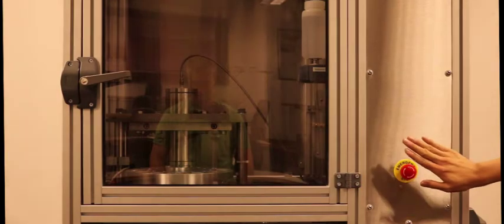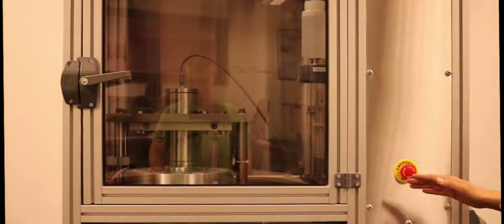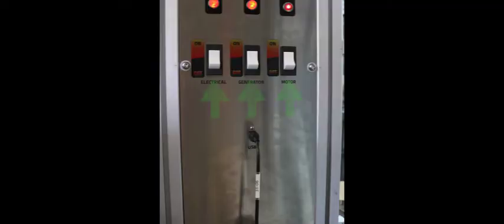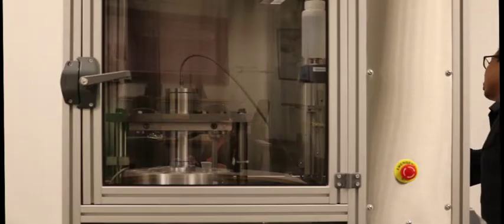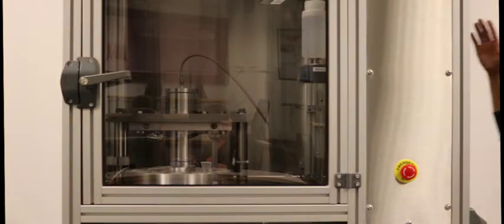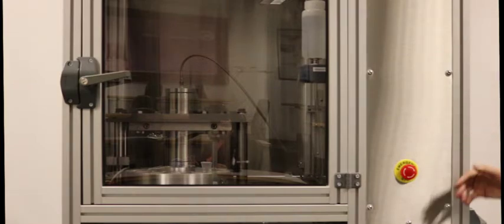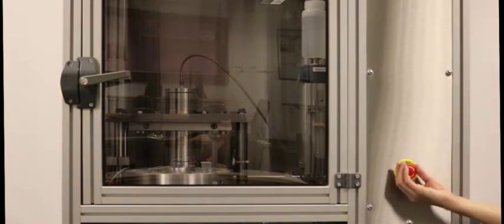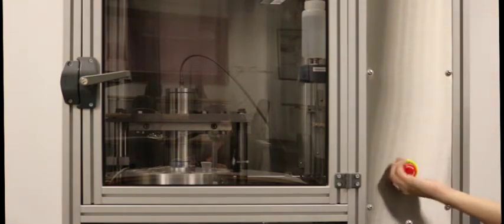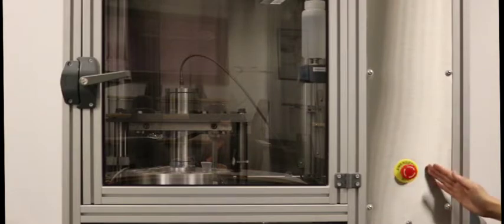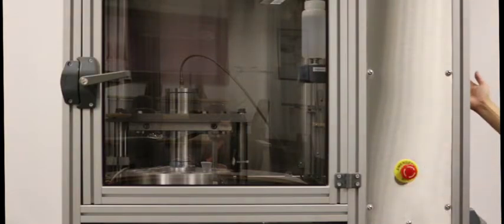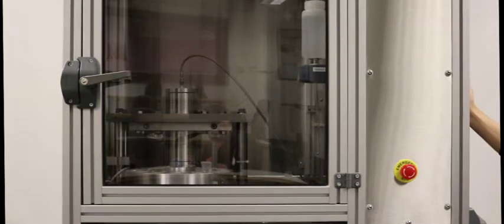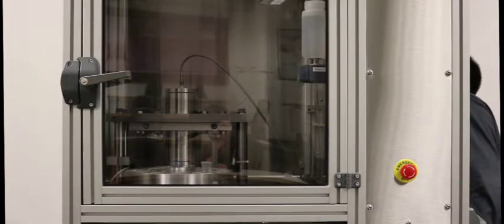To resume operation, turn the three power switches on the rear of the machine to the off position. Then reset the emergency stop button by twisting and pulling outward. Finally, return the power switches to the on position. This will bring the APDP-HP101 back to normal operation.